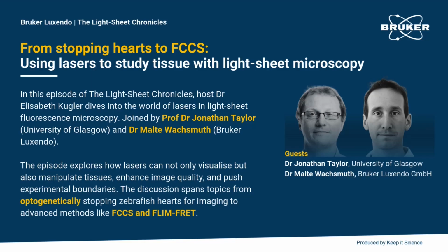Yeah, completely right. The challenge doesn't necessarily lie in the acquisition process, but it's really the processing that is the most challenging part of this kind of experiment. The good news is that nowadays you don't have to take care of this yourself anymore. For example, the lab of Thorsten Wohland at the National University of Singapore has developed a very nice Fiji plugin for the acquisition, processing, and also interpretation of FCS, camera-based FCS, and FCCS data.